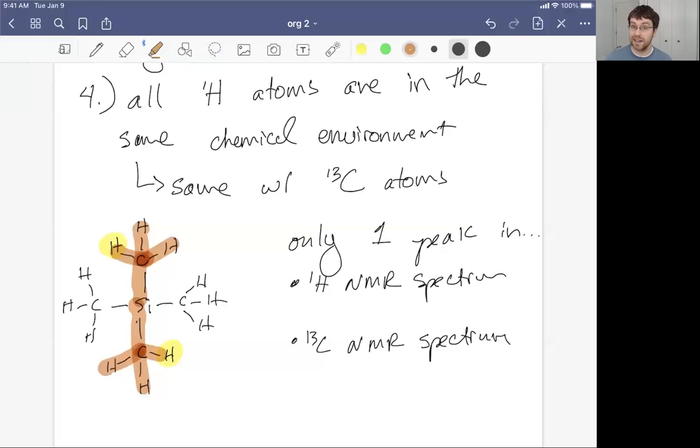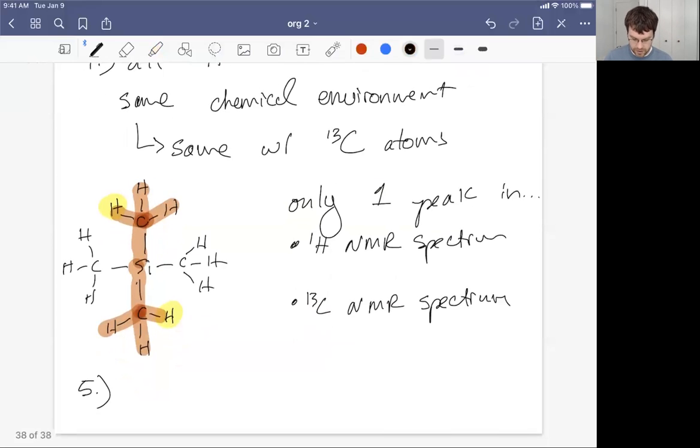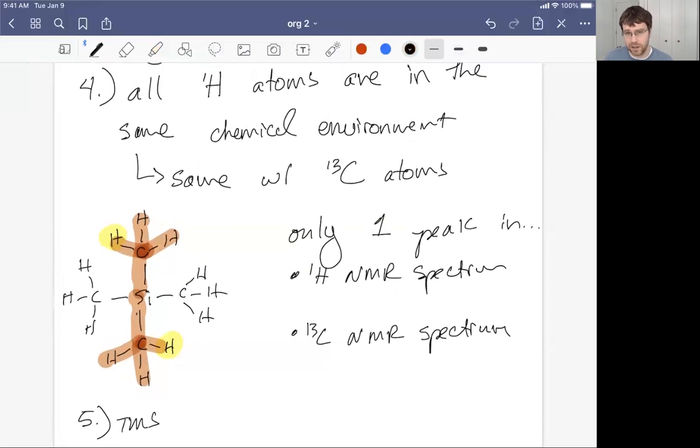That's great. That means it doesn't convolute or kind of complicate the NMR spectrum with a bunch of peaks that we have to recognize are part of the reference molecule. You know, it's like, oh, I just want to see one. Well, TMS is great for that. Now, additionally, kind of an added advantage is that TMS, and this isn't critical, but it's really helpful, TMS pulls the one peak away from most other peaks.